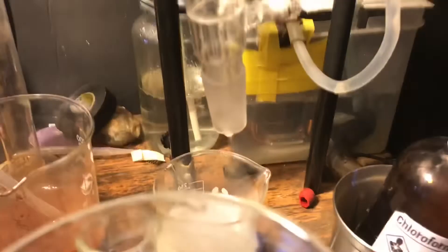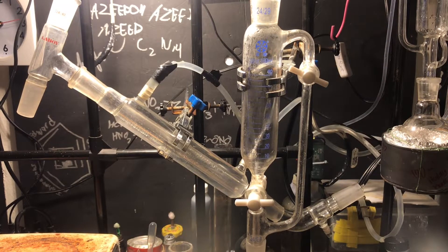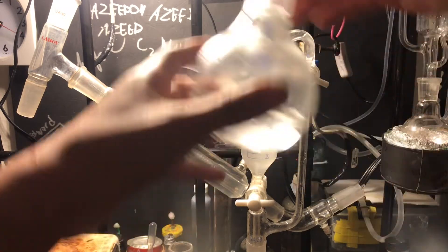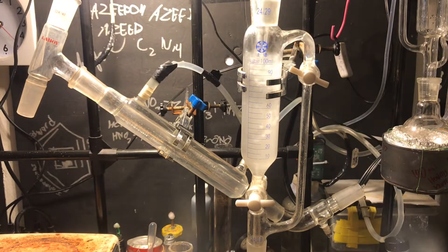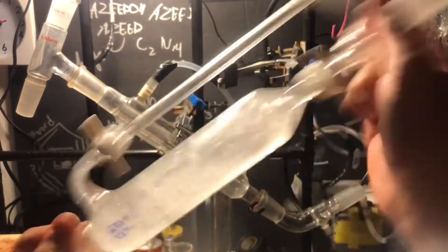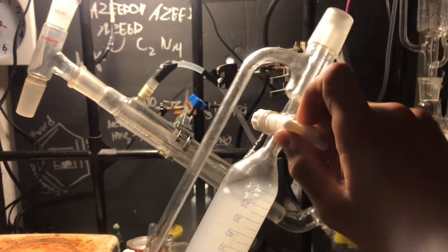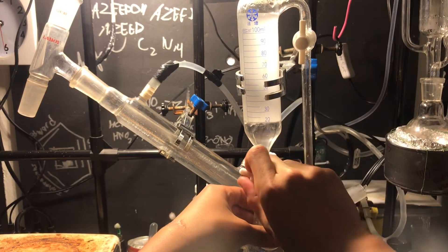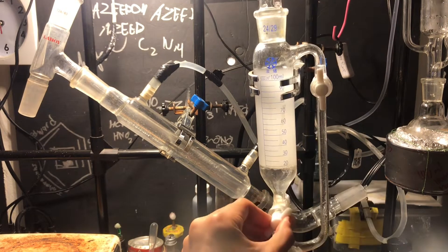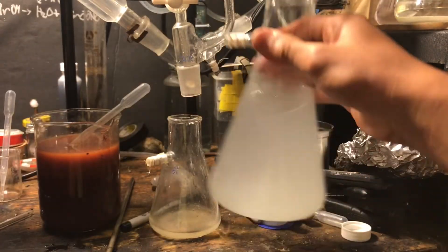The whole lab smelled like cinnamon — it was lovely. Next, take your cinnamon water and add it into a separatory funnel, then add in your extraction solvent of choice. I'm using chloroform because it's easy for me to acquire, and ether is a bit too volatile for my liking. If you're using ether, make sure to vent very frequently; with chloroform you don't have to as much. For ether, take the top layer; for chloroform, take the bottom layer — chloroform is more dense than water, ether is lighter.